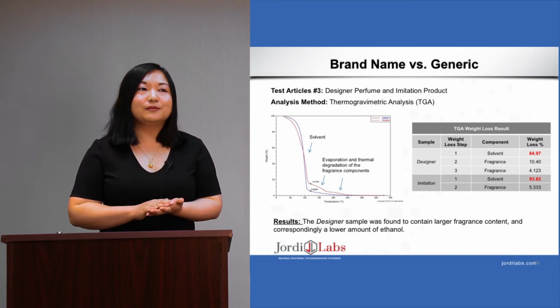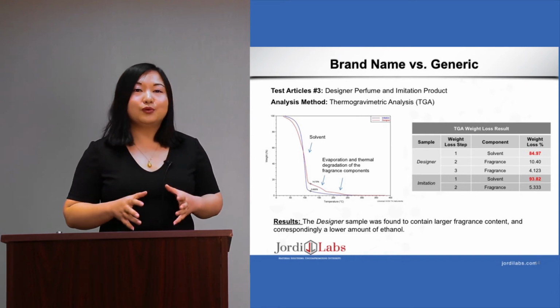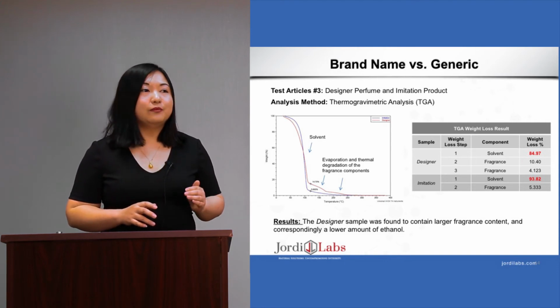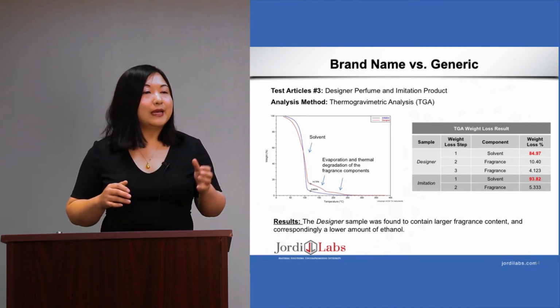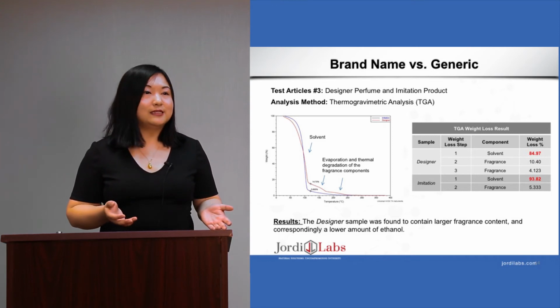So earlier I talked about how we use different techniques to deformulate certain products. Another aspect of deformulation is that we can use these techniques to compare different products. For example, we can compare brand names with generics using these techniques.